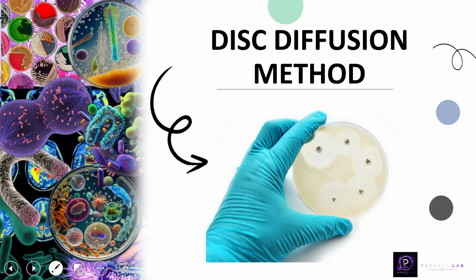In today's video we will explore the disk diffusion method, which is a simple technique used in antimicrobial susceptibility testing. We will also see how antibiotic disks create zones of inhibition and how these zones help us to determine whether bacteria are susceptible, intermediate, or resistant to an antibiotic. So let's get started.